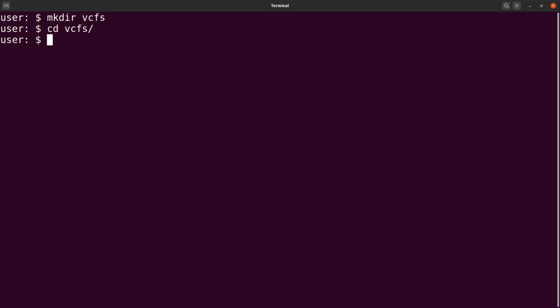The reason why I do this is to separate files that I'll be generating for this exercise from other files on my PC. Doing this helps you to organize your files and prevent accidental removal and modification of files. So that is why I create directories for every project that I do.